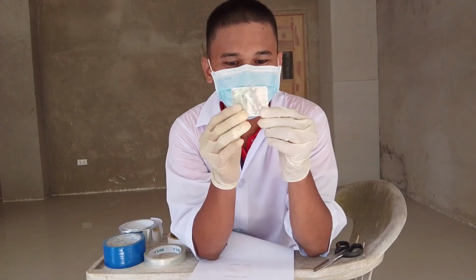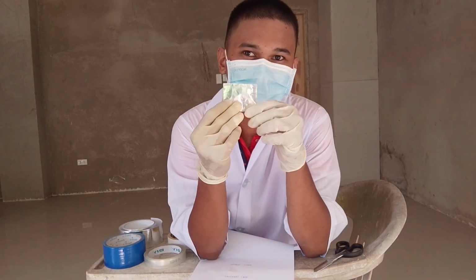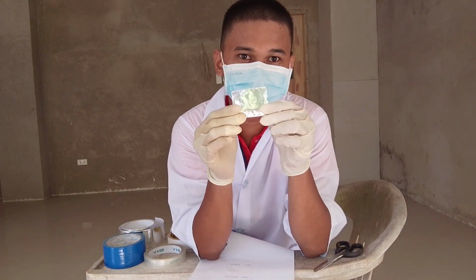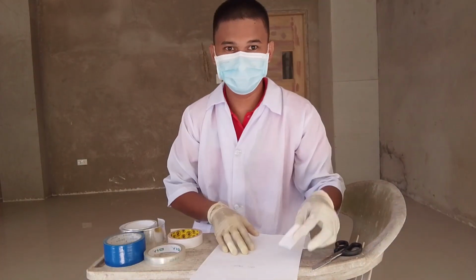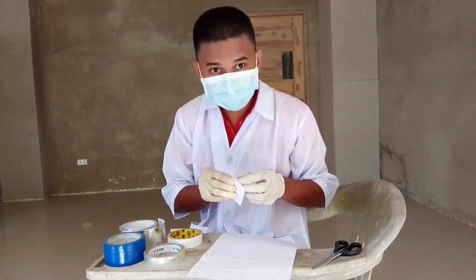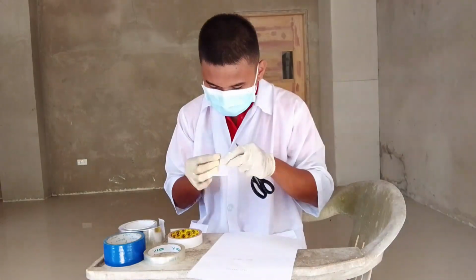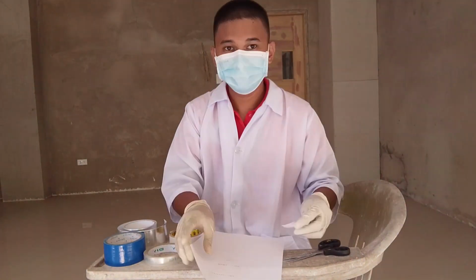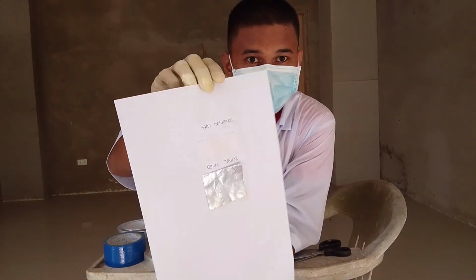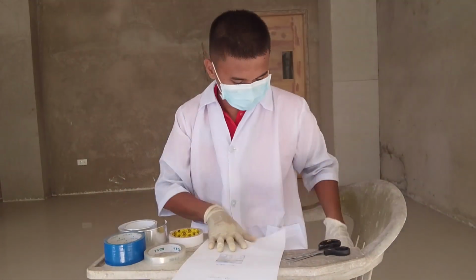The color of this aluminum foil tape is silver, and the edge characteristic of this tape is flat also. I will now put the samples in the paper. I am done putting the sample, so I will now label it.